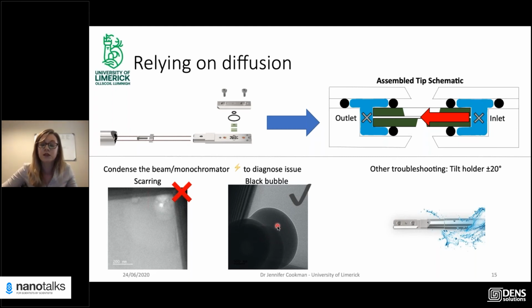Now, this is done in just ethanol, and you can get this also in the solution where you have flufenamic acid and ethanol, but you'll get this simultaneously with the crystallization of the crystals. But this can also happen, let's say, if I've introduced the solution of flufenamic acid and I'm not seeing crystallization. It just means that the solution hasn't passed through the windows yet, and it could just be sitting with ethanol.